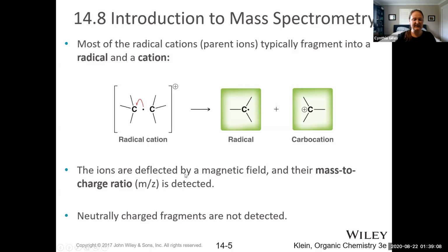On the x-axis of a mass spectrum, it's called m/z, which stands for mass to charge. So basically it's the mass divided by the charge of an ion. And remember, only ions reach the detector, so there's always a charge, and +1 is very common. So since it's pretty much always +1, z is equal to 1. So on the x-axis, it really just corresponds to the mass.